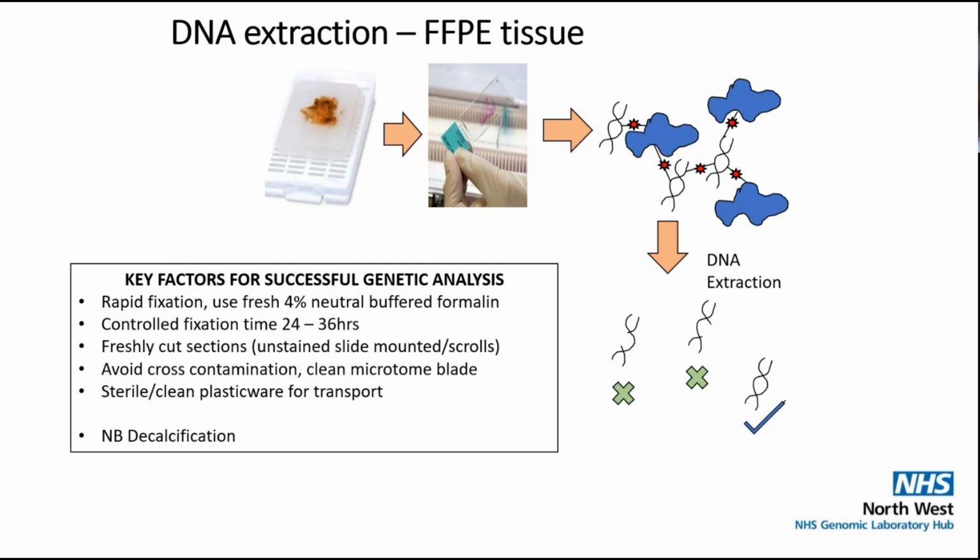There are methods for decalcification using more neutral solutions such as EDTA and using a longer time period, which are better for genomic analysis, but obviously there's a balance between the decalcification requirement in histopathology and whether the genomics is needed and how it's going to impact any downstream testing.